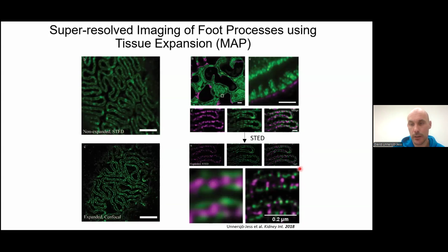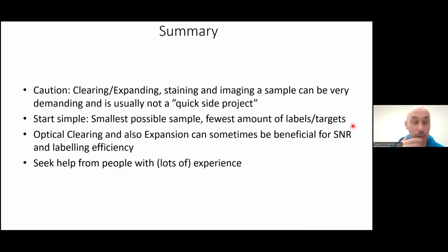And we were actually the first ones to publish the combination of expansion microscopy with STED microscopy, but we didn't really dive much deeper into this. So we hid it just in the supplement of the paper, and then other people published it afterwards. Yeah, so I think that was everything I had actually.